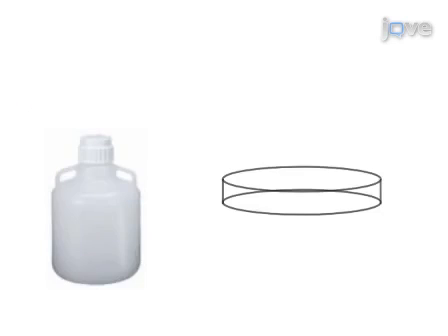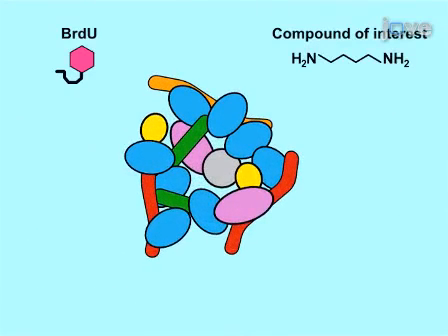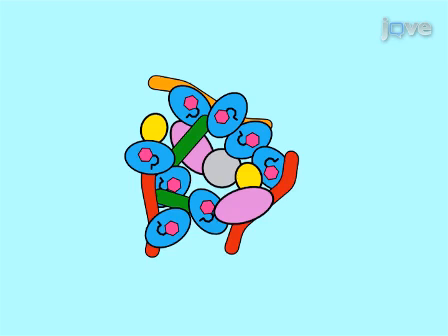Water samples collected from a test environment are processed and incubated with a compound of interest and bromodeoxyuridine, BRDU, which incorporates into newly synthesized DNA and actively growing cells.